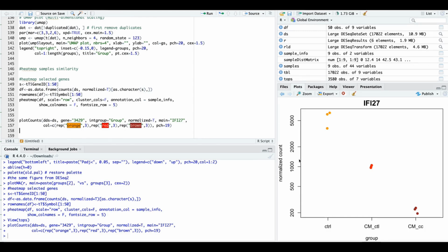These are almost all illustrations you could find and use from Geo2R and DESeq2 user's guide. I skipped a few. You better not take all of them, but be selective. Take what you find appropriate and suitable for your presentation or publication. That's it.